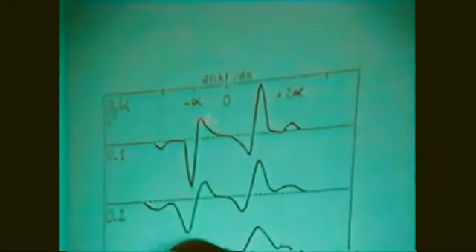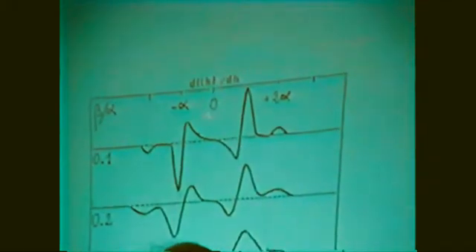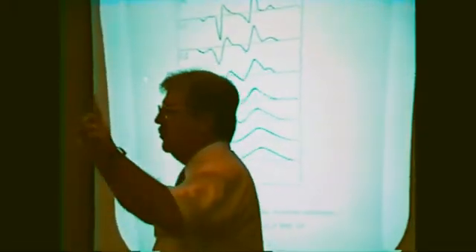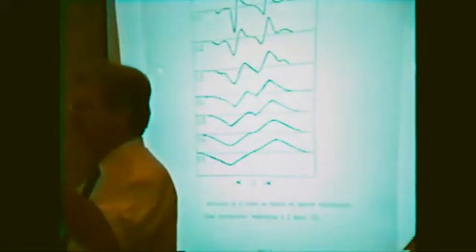And you see that when you increase the distance between two protons, you change really very much the shape of the signal. And if you are able to simulate such spectrum, you have immediately the distance between the two protons and the average distance between two adjacent magnetic configurations.